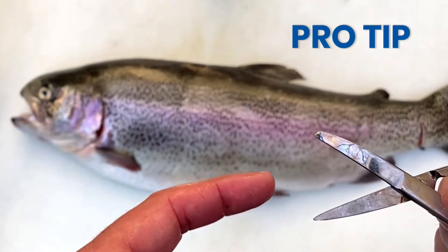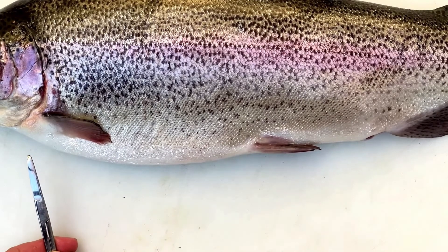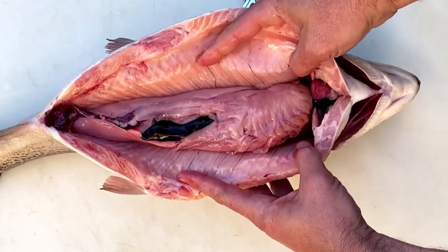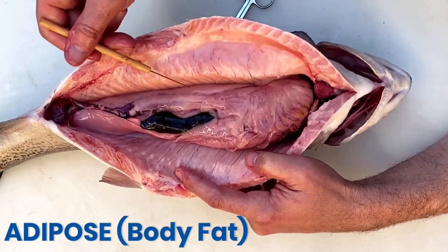I'm going to start my dissection by cutting from the anus towards the anterior portion of the steelhead. Farm fish tend to have a lot of body fat compared with wild fish because they have easier access to food and they usually don't get as much exercise.